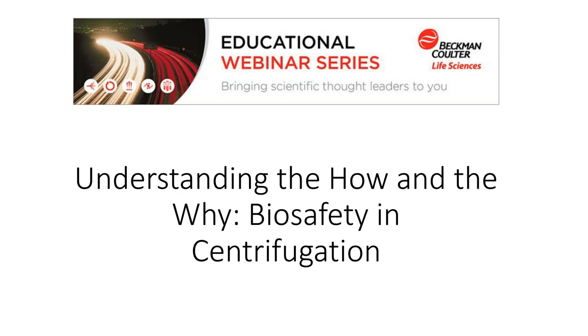So they're diagonally across. What I tend to see people do is I think they forget that you have to be the spindle to look at the bucket. And so they'll put it in the upper left on one bucket, but then they'll wind up putting it, I think it would be the lower left position on the other one. It's not balanced. The other thing is with those little multi-holder thingies, sometimes you have to give them a tiny little rotation so that they're directly across from each other.